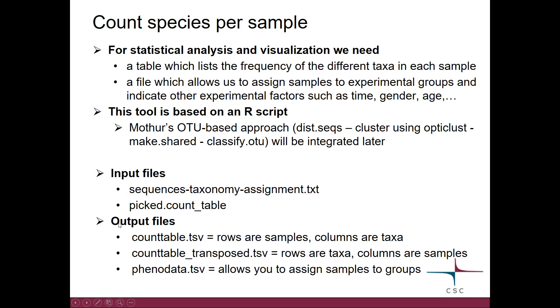As output tables you get these two things. This table is also called count table — confusingly — where rows are samples and columns are taxa. Depending on your parameter settings, you will also get the same thing transposed, so that rows are taxa and columns are samples. The phenodata file is the one that allows you to describe your experiment to Chipster.